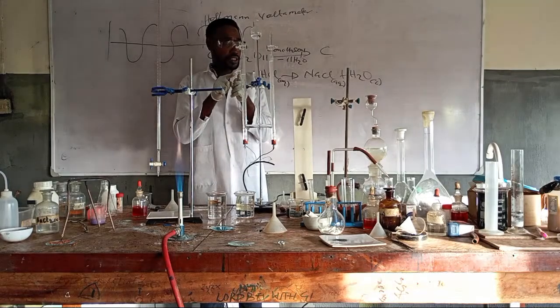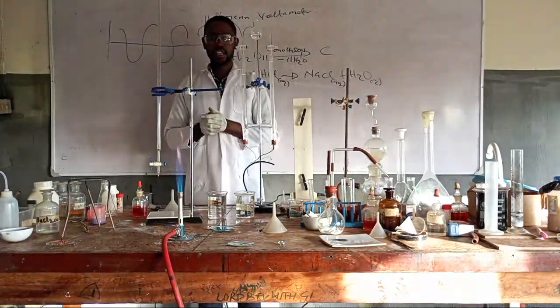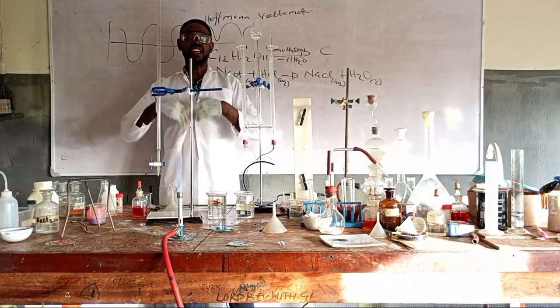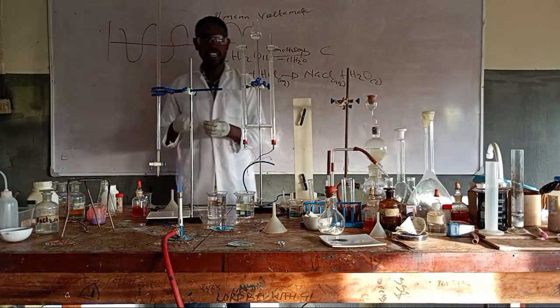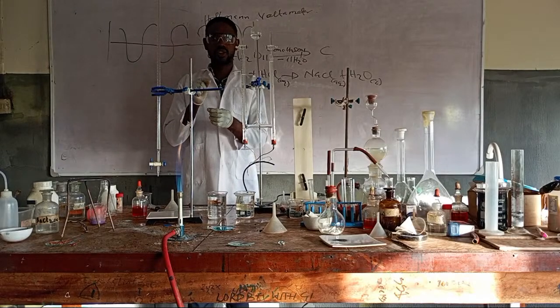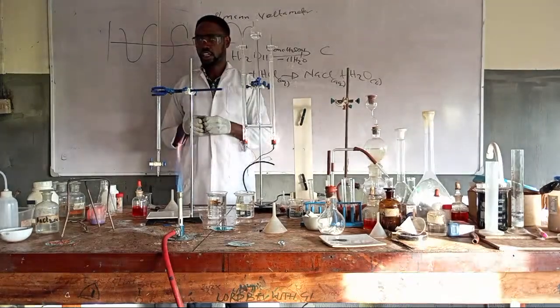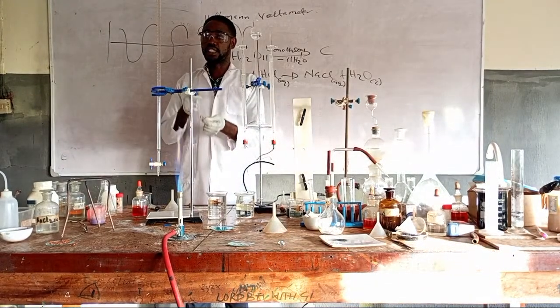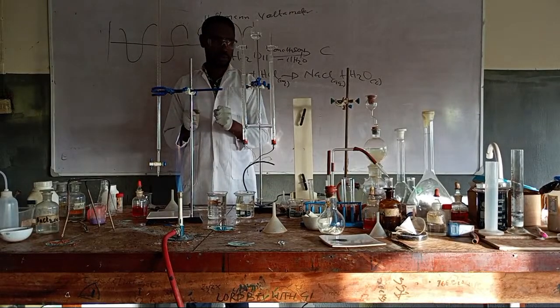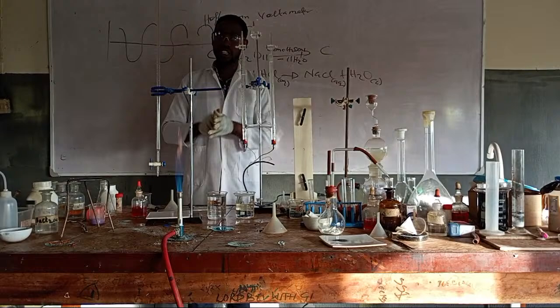Yes. So it remains oxygen. So what did I say oxygen will do? It will rekindle a glowing flame. Meaning, if something is burning and you insert it in oxygen, it will burn fast. It will glow. If you have extinguished it and put it, it will not give all this sound. Today, you have learned the test for hydrogen gas.